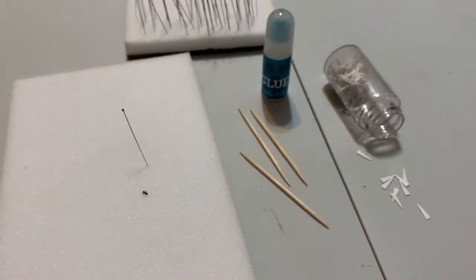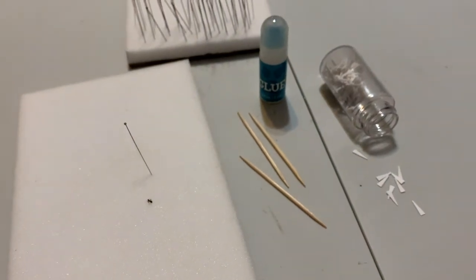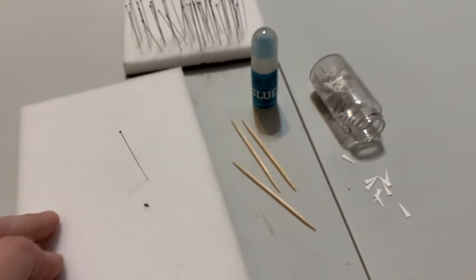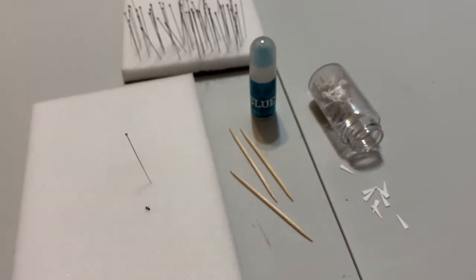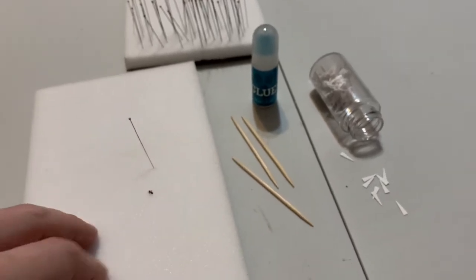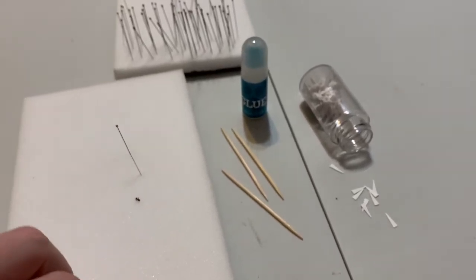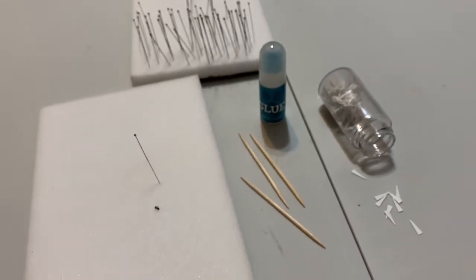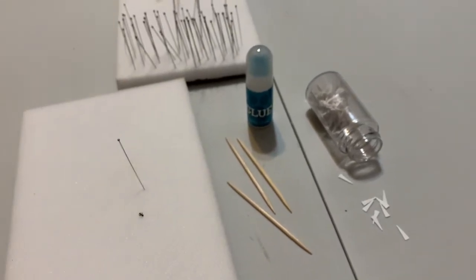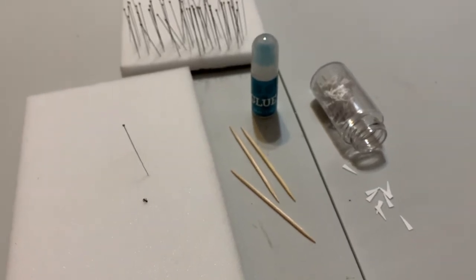There are extremely thin, small pins that you probably could use to pin this ant, but I don't recommend that you use pins that small, mainly because they will easily bend when you try to put them into foam. Some storage cases for insects have harder surfaces to put pins into even than this foam, and they easily bend. Once a pin is in an insect and the insect is dry, there's no changing the pin, so it's better to just not use those to begin with.